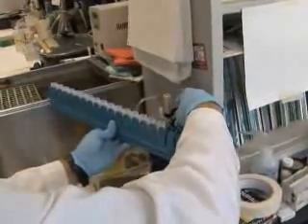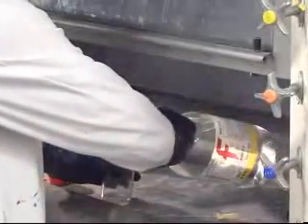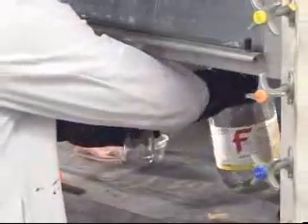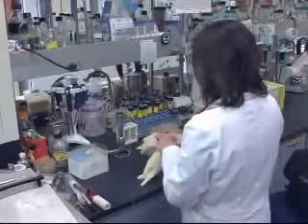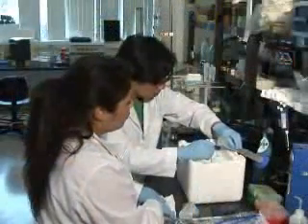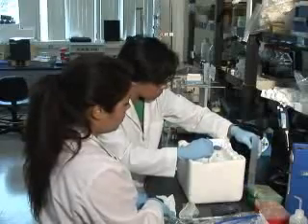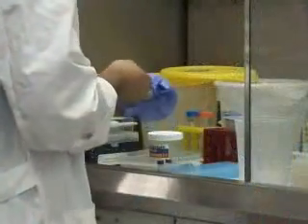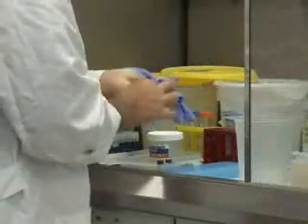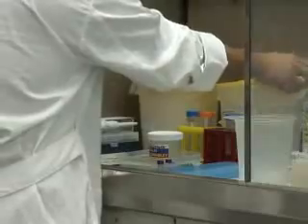laboratory practices and equipment. Laboratory use of hazardous chemicals is the handling or use of such chemicals in which all of the following conditions are met. Chemical manipulations are carried out on a laboratory scale. Multiple chemical procedures or chemicals are used. The procedures involved are not part of a production process, nor in any way simulate a production process, and protective laboratory practices and equipment are available and in common use to minimize the potential for exposure to hazardous chemicals.